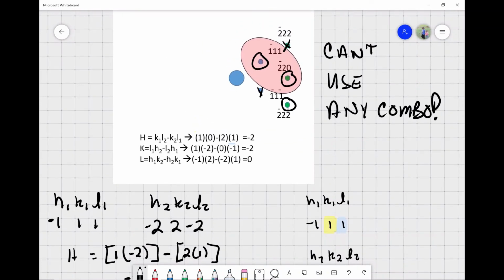So if I pick this one, I can't pick in the same order of diffraction, and I can't pick the very next one. So I can't pick the second order of the same spot, but I can pick the second order of the spot on the other quadrant, if you will. But I just can't pick the next adjacent one, and I can't pick the ones in the same order. So that's the ones you can't use. So almost every spot. Hopefully this is helpful. Hopefully this clears up, and I'll fix my previous slide.